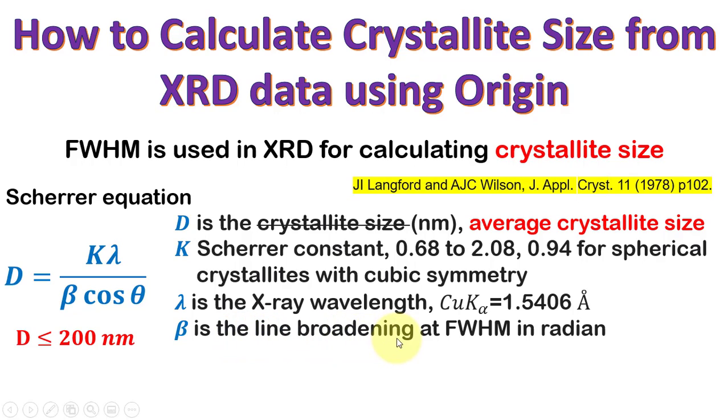Beta is the line broadening at FWHM and we must use this value in radians. Origin will give this value in degrees and we will have to convert it. Finally, theta is the Bragg angle in degrees, and in XRD we plot two theta values so we will take half of that value.